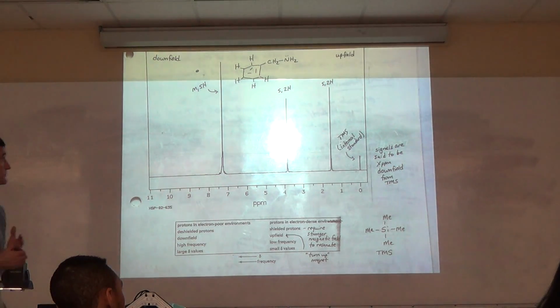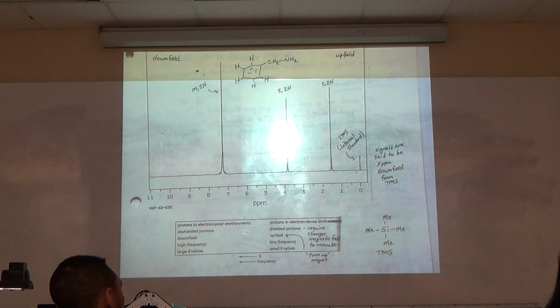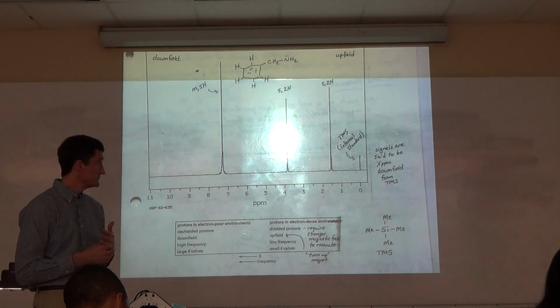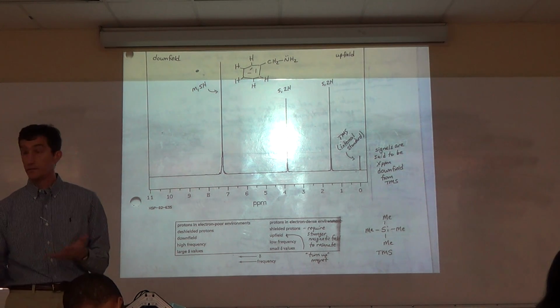The reason is, well, we haven't pointed out yet that you've got to use a magnet. That's the M of NMR. But your magnetic field strength can vary day to day, and so your peak position varies day to day.